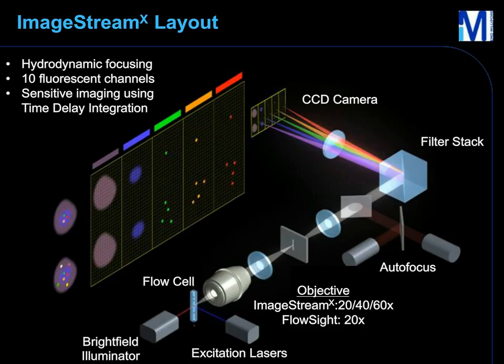Once a sample containing particles is prepared, whether it's fluorescently labeled or not, this isn't a requirement, that sample can then be loaded into the instrument. After the sample is loaded, it is hydrodynamically focused into the flow cell. This hydrodynamic focusing step is not performed in most flow microscopes, including MFI and FlowCam, and is an interesting advantage of imaging flow cytometry because it allows high magnification imaging.